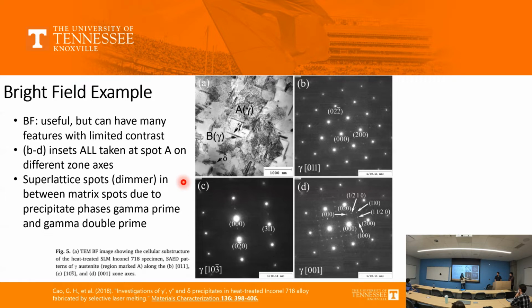Take it to another zone axis. I come here, then I move to a Kikuchi line and go to another zone axis. Do you think I would be seeing this same relationship?